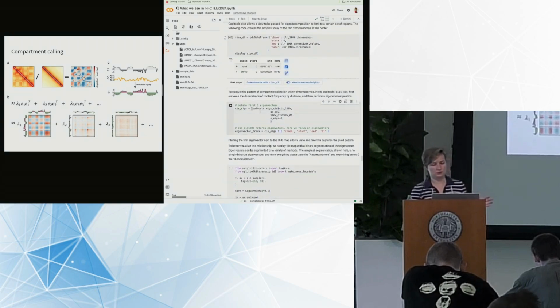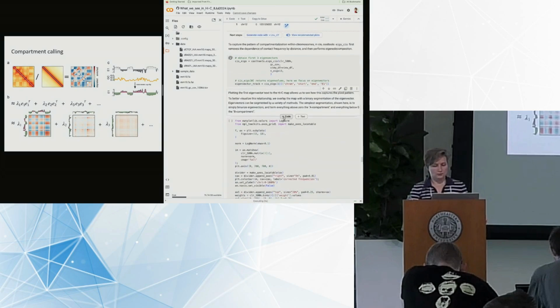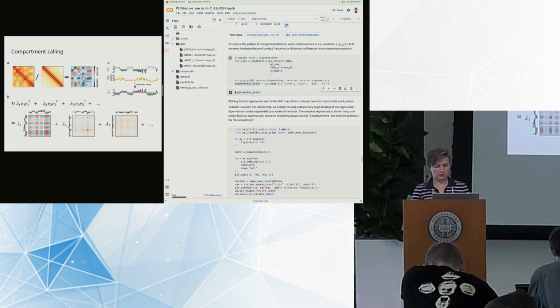I will need a simple function of cooltools, eigs_cis, so it will be cis data used for calculating the compartments. I will input my 100 kb cooler and GC content, and I would like to run it for my particular chromosomes, because I know that I do not have the full information for the whole genome, so it is just 2 chromosomes that I work with. Now, let's take a look at the eigenvector track. The calculations might take some time.